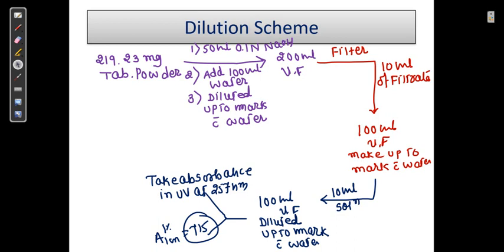Every time you do not require to see the whole procedure, and the schematic will help you. As well as in the assay calculation video, I have given the calculation in one formula based on a dilution scheme. You can go through that and do the calculation. After doing this calculation, we have a result.